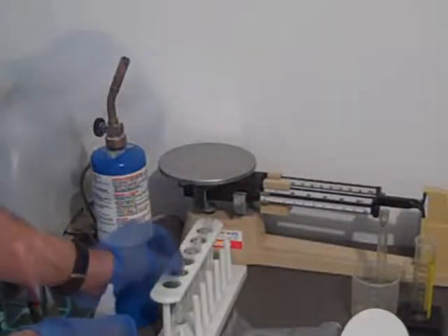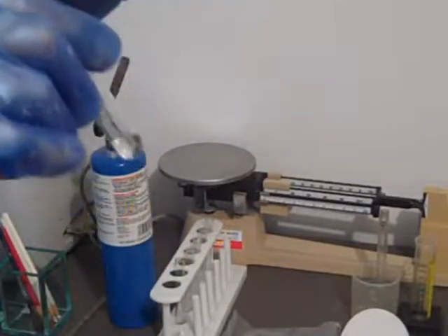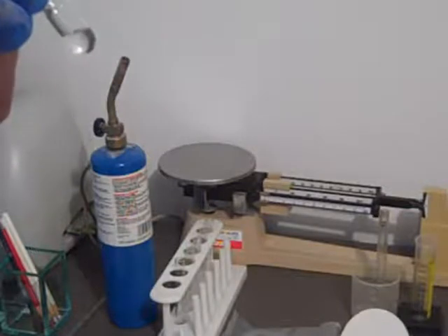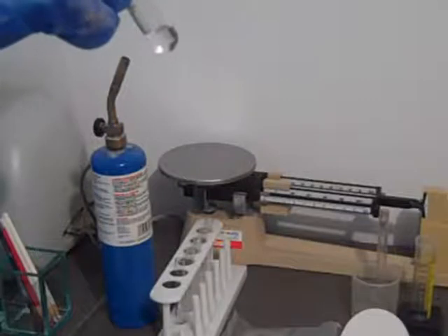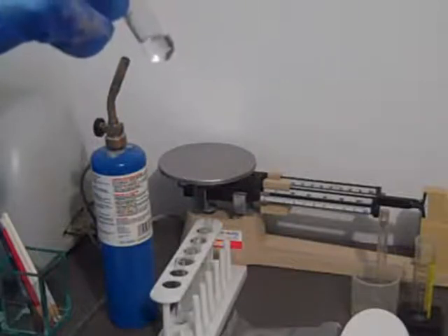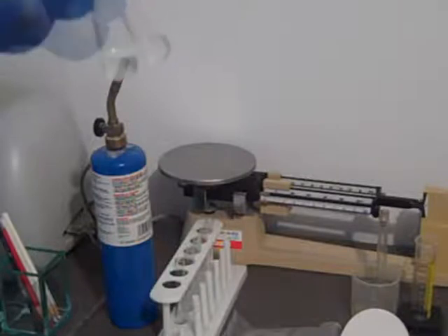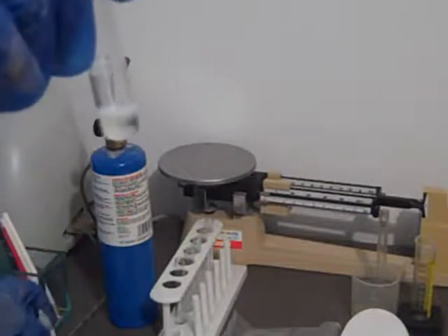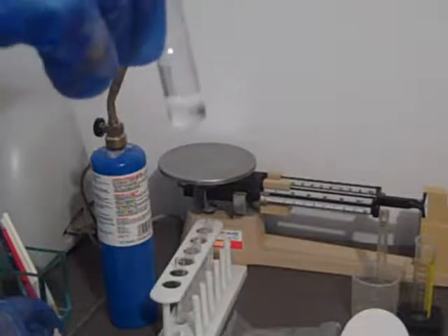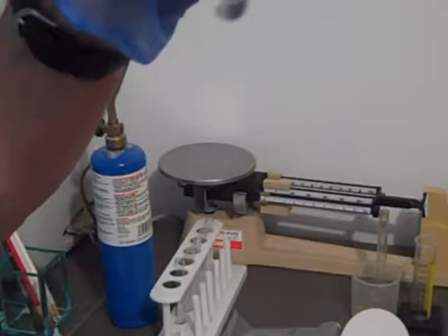We've turned our flame off and now we're going to add some silver nitrate droplets to the rest of the filtrate in order to test for chloride ion. When the silver nitrate droplets combine with the sodium chloride that's in the filtrate, it turns into silver chloride, which is an insoluble precipitate. You can see the white precipitate that's formed on the top of the solution.